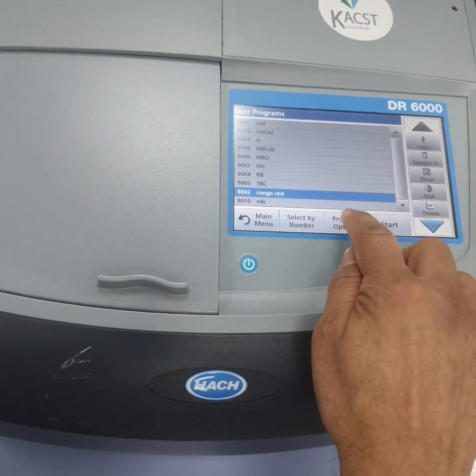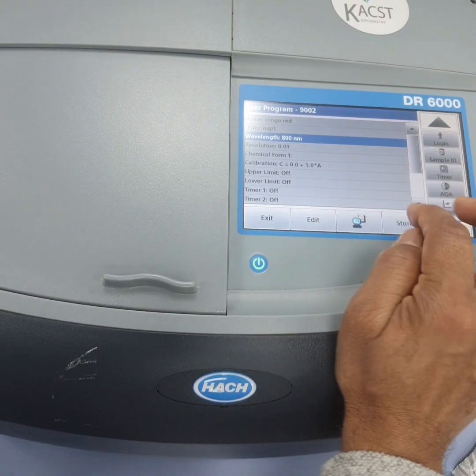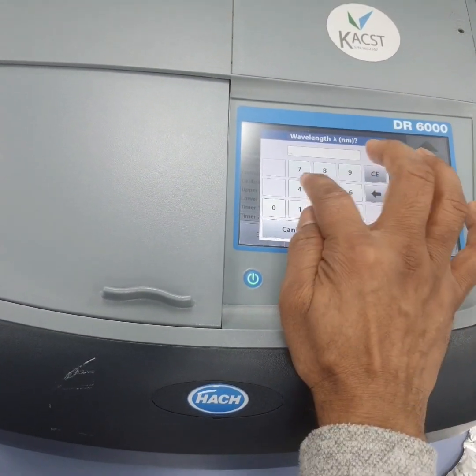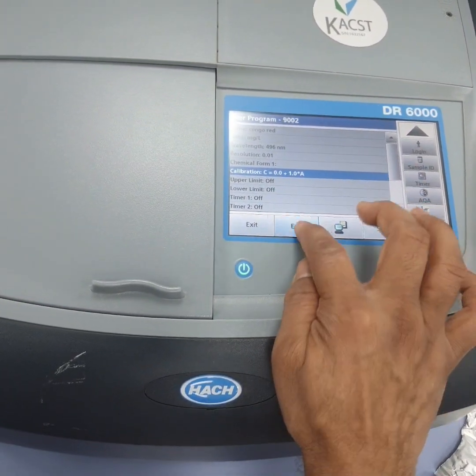This is my Congo Red. I'll choose program, and then I will edit. So I have to edit this one. So this is how much, students? 496. Okay, now I will edit my calibration.